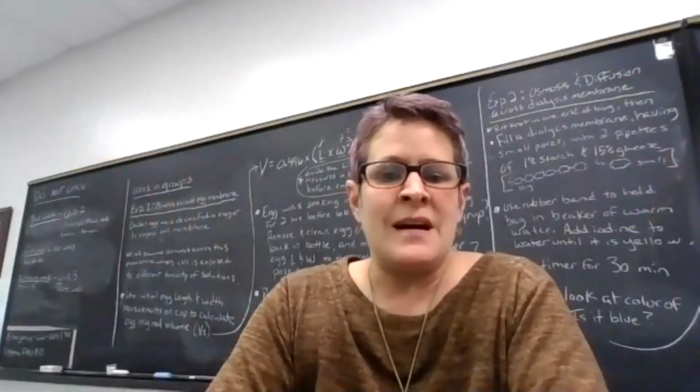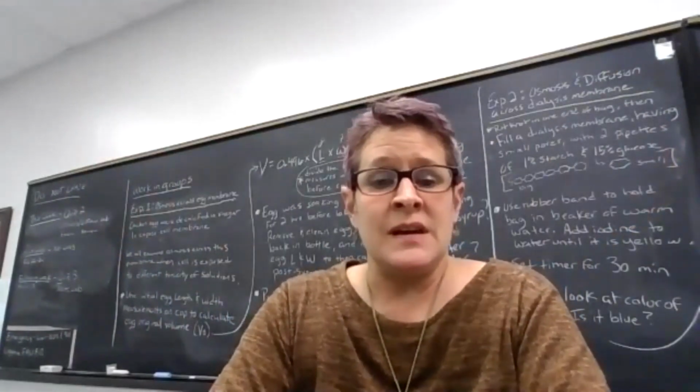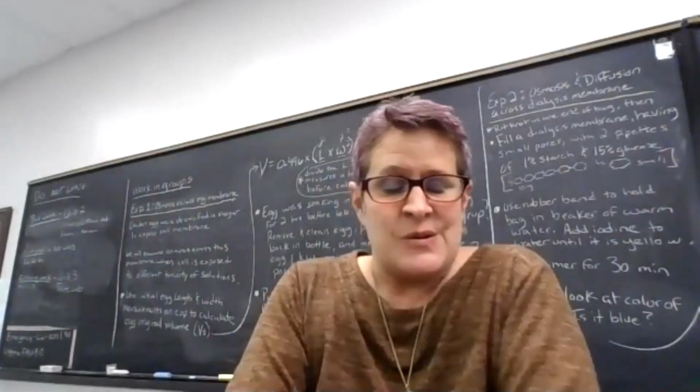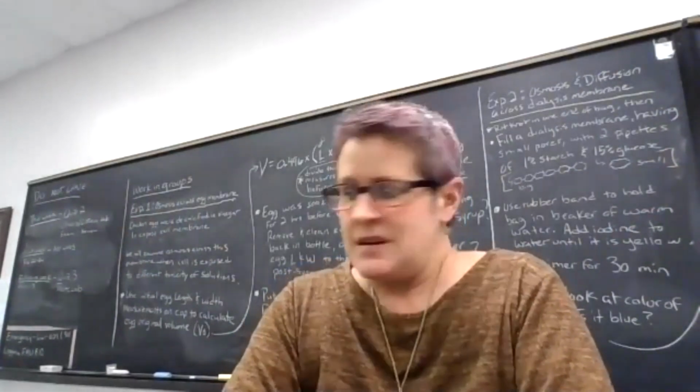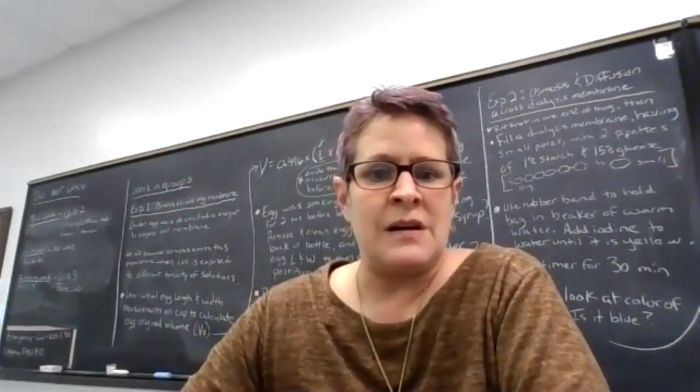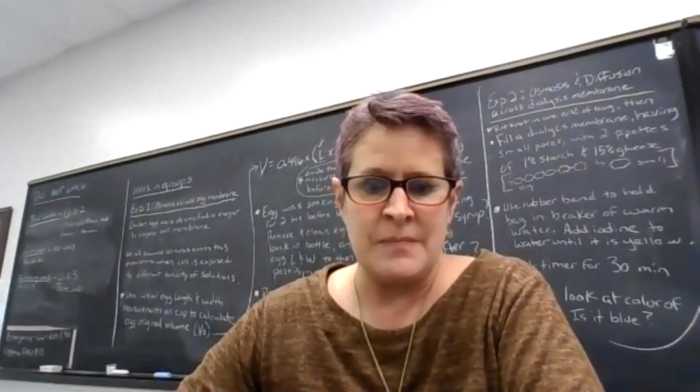Today's lab, we're going to be looking at osmosis and diffusion, and we're going to do it with two simple experiments that last only about 30 minutes. I'm going to show you how to set up the two experiments, but first, let's look at the online handout for today's lab.